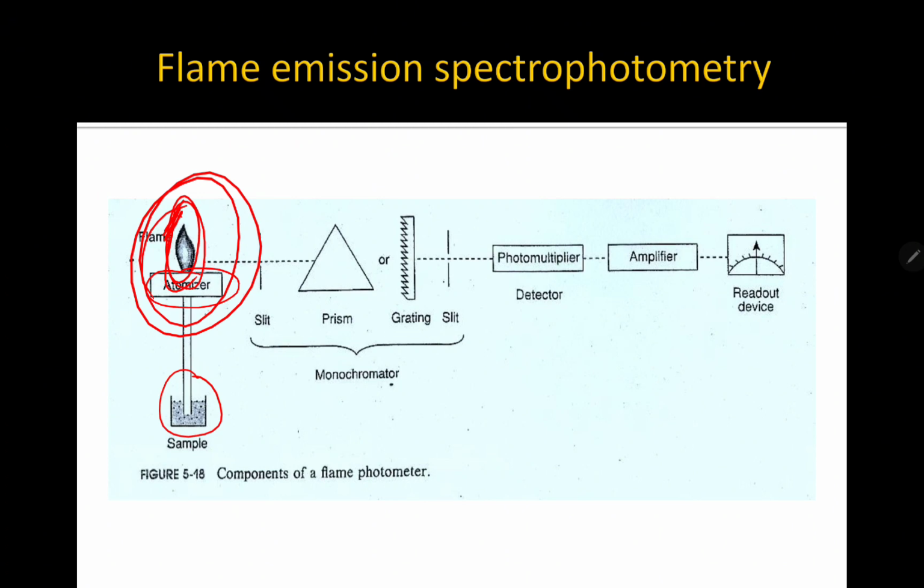Na-get so far? So when the flame or the light, yung excitation na nandito nangyayari, meron ma-lose na energy kaya mag-stop ang excitation at some point. Lahat ng light na yan, guys, ma-emit, okay? Ma-emit will now be processed. Will go into your entrance slit once again, do the grating and then the slit. And then mababasa na siya ng photomultiplier. Depende, mauuna siya kung ano yung test na gagawin mo.